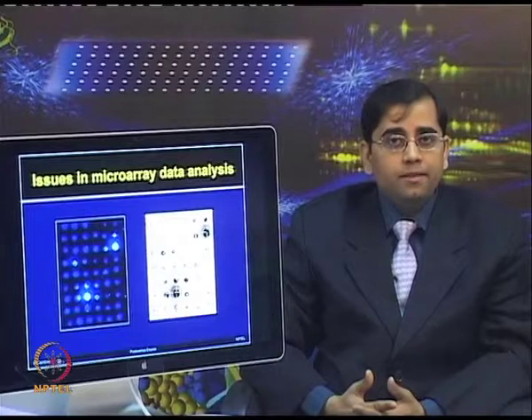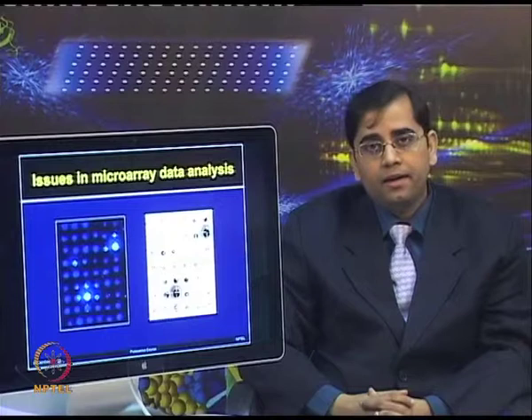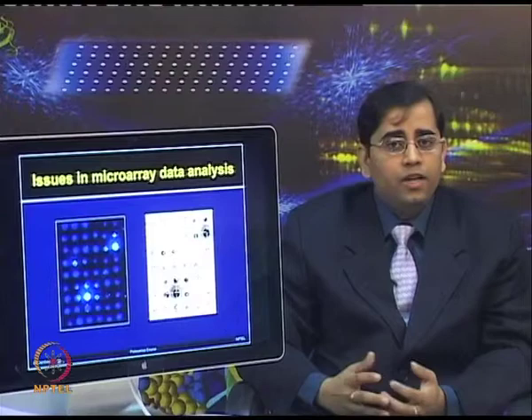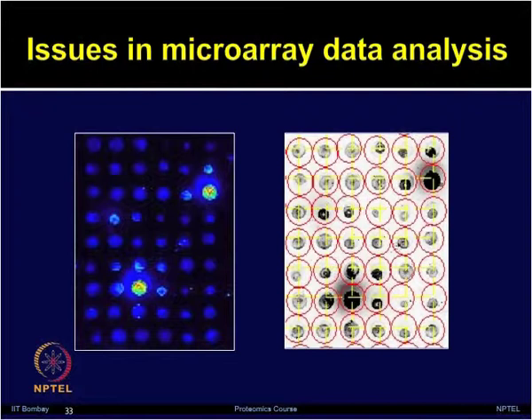Scaling up is a good approach because one wants to perform high throughput experiments so that thousands of features can be studied simultaneously. However, while scaling up, especially when you are using cell-free expression based approaches, one needs to be cautious about what should be the optimum density for these arrays. Because if there is a spillover of expressed protein onto the neighboring spot, that is going to affect the values for the neighboring spot. Again, this slide shows how protein is diffused into the neighboring spot, which should be removed. Similarly, background correction and various other parameters one needs to analyze to perform a good microarray data analysis.